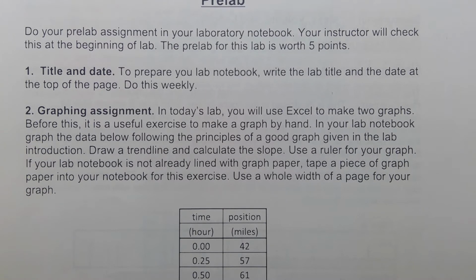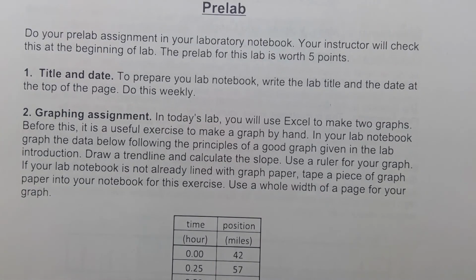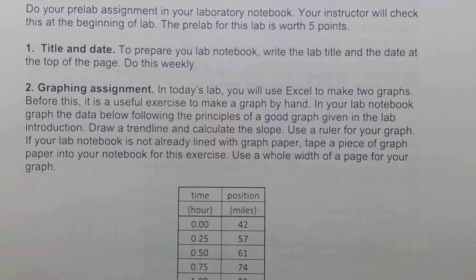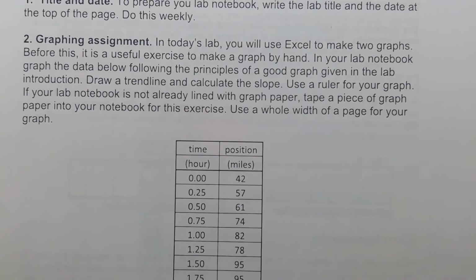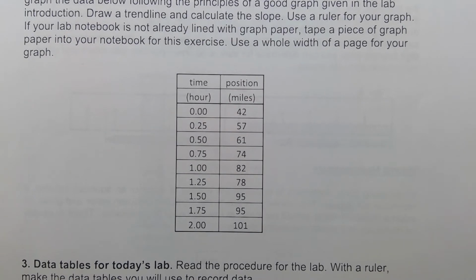If your notebook doesn't already have graph paper, you can tape a piece of graph paper into your notebook. So you can just print out some graph paper or buy it at the store, or get creative if you can't do either of those things. I don't have a printer at home, so I would not fault you. Use the whole width of your page for your graph. So this is the data that you'll be graphing.